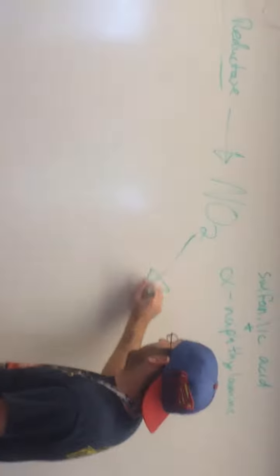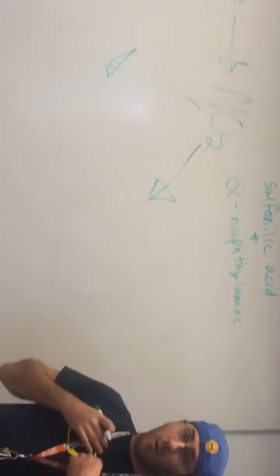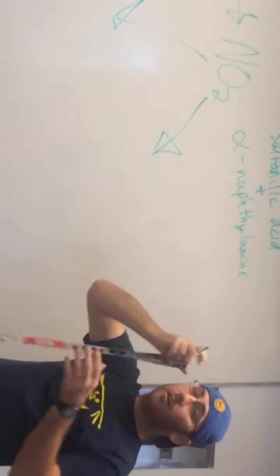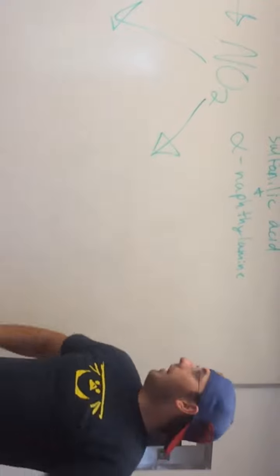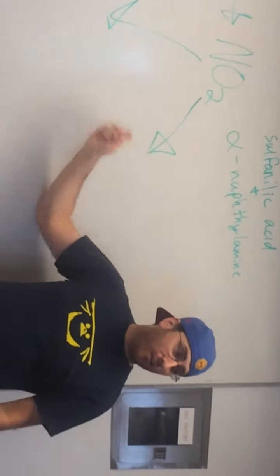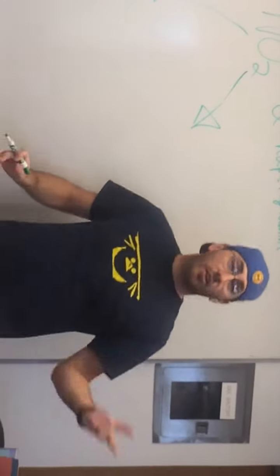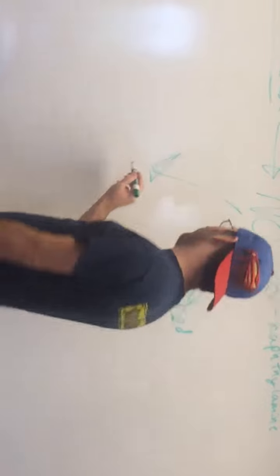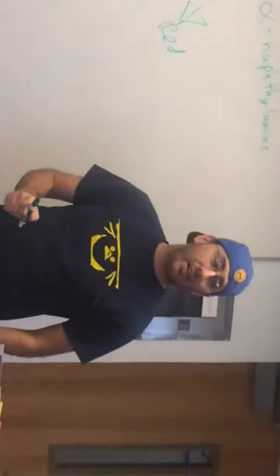Okay, so we add these two reagents. What are our possible outcomes? What are we looking for? In the test tube, you add these reagents and look for a color change. What are our color changes? Red, and the lack of color change, not red.